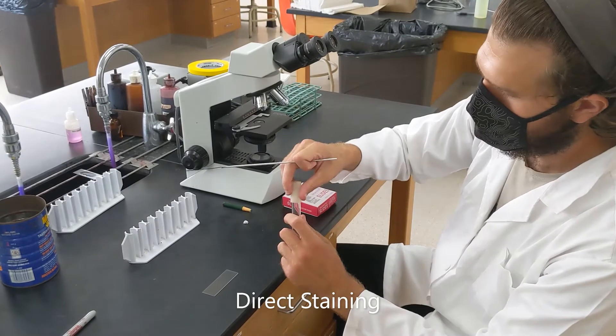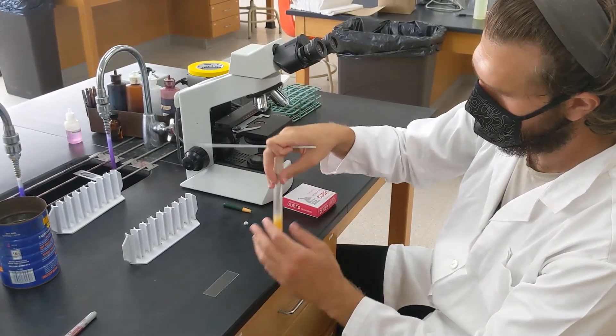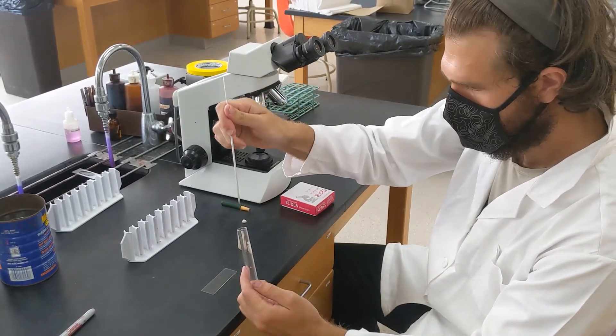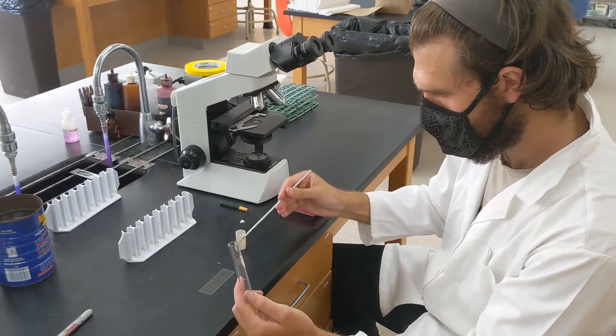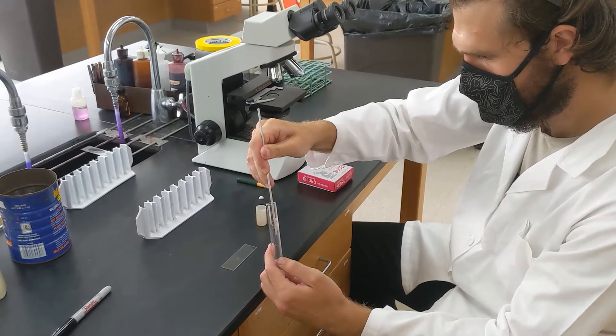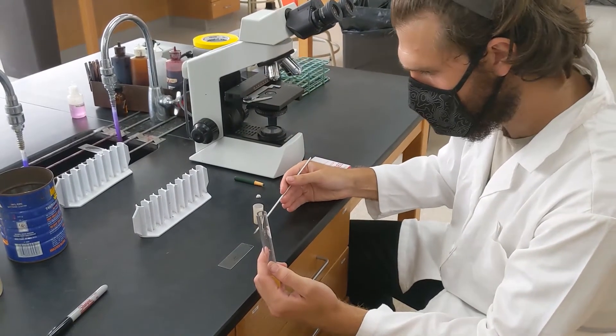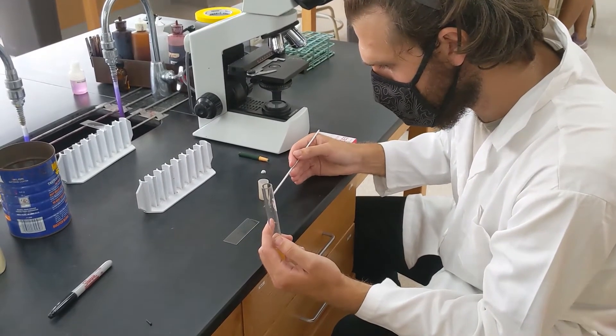So to start off your direct stain, I'm going to take the mix culture, the same as we used to streak the plates. Take a loopful, I'm actually going to use two loopholes, and spread it out kind of around the middle third of the slide.